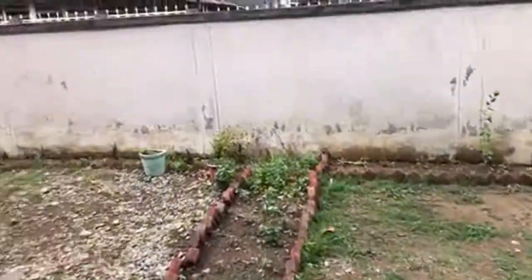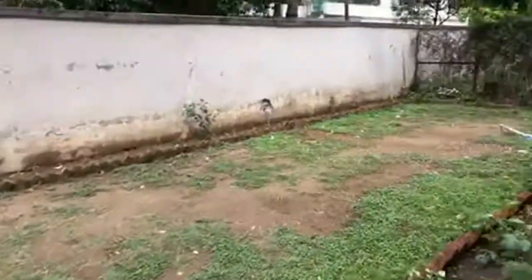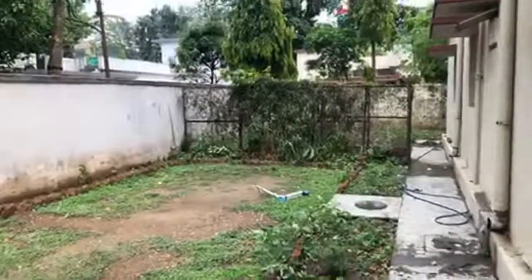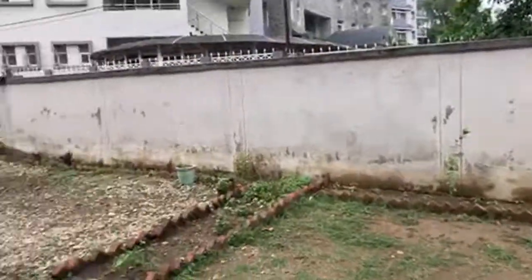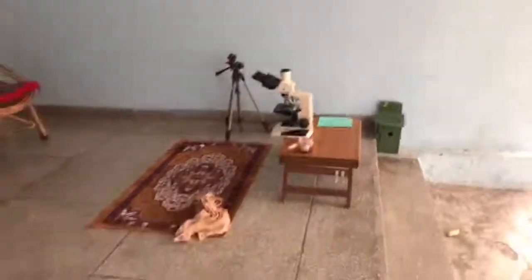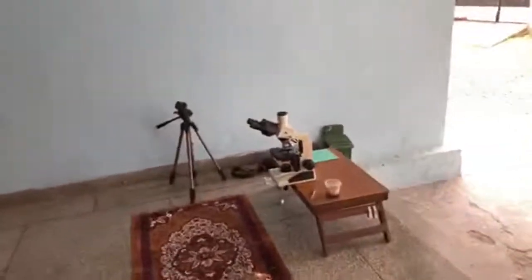In any case, as promised, I'm ready with the microscopy session. Since there was a little hailstorm outside, I just decided that I'll sit out and do the microscopy here. So there's the setup. I've got the microscope outside, and I'll be sitting here on the veranda and scan through the sample.